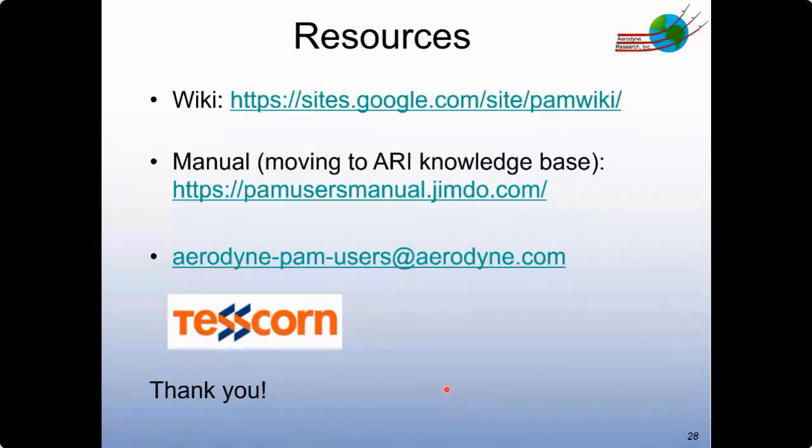But if we were talking about a lab study where you are actively controlling the humidity, the system comes with a Nafion humidifier that, when it's just fed room temperature water and dry air is flowing through it, gives a typical humidity, depending on the flow rate through it and any mixing or dilution with dry carrier gas, of about 50 to 60% relative humidity without doing anything.